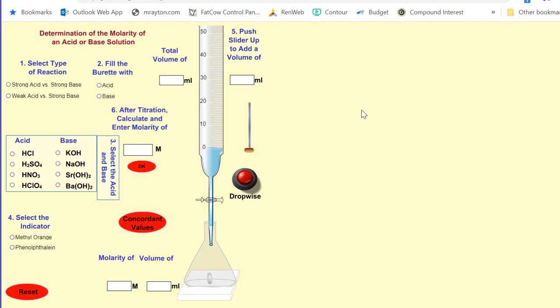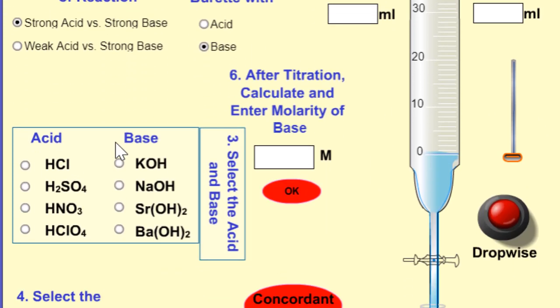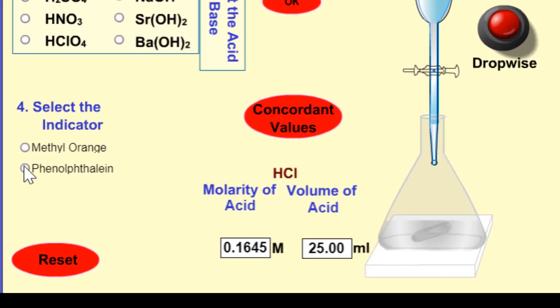Let's go to lab number two. This is lab number two. We're going to do a strong acid versus a strong base. We're going to fill this burette with a base. We're going to use hydrochloric acid and sodium hydroxide. What we normally use right here. And you can see it has gone all the way up. And we're going to use phenolphthalein. Phenolphthalein as my indicator. Now take a look down here.